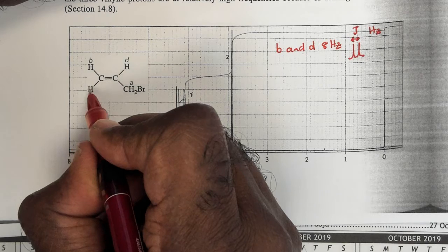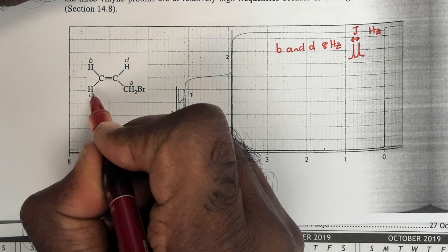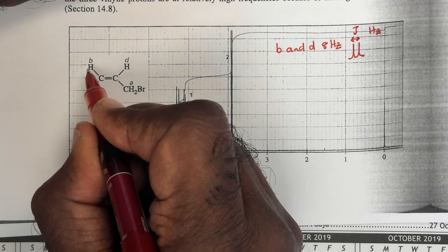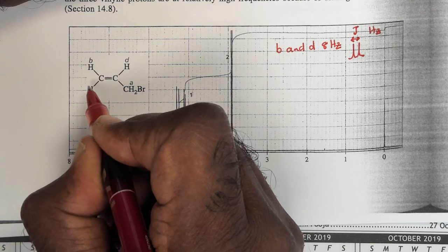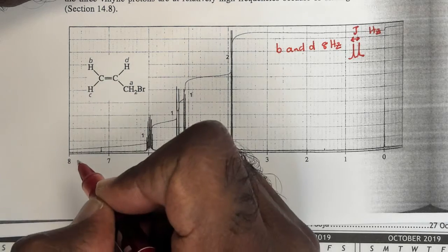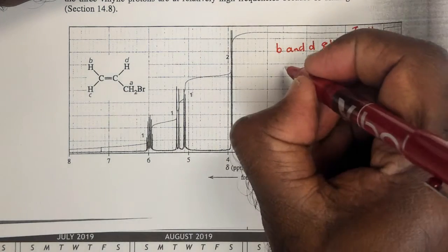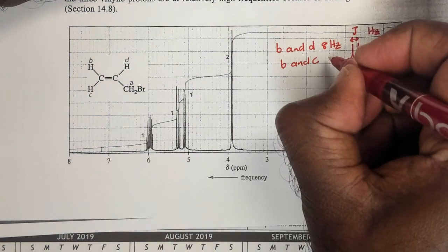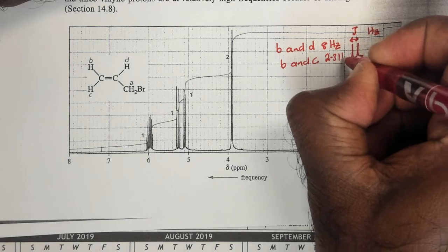Likewise, we can see these two geminal protons, the protons which are bonded to the same carbon, so we call them geminal. Gemini comes from the word Gemini. So two protons on the same carbon, B and C, would have a coupling constant of around 2 to 3 Hertz.